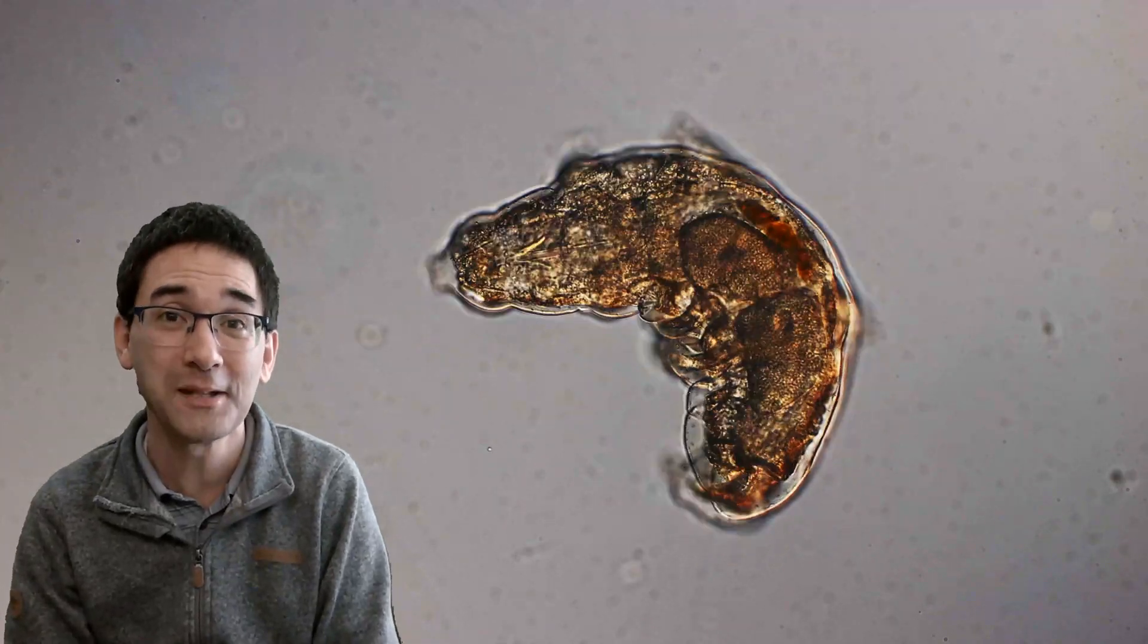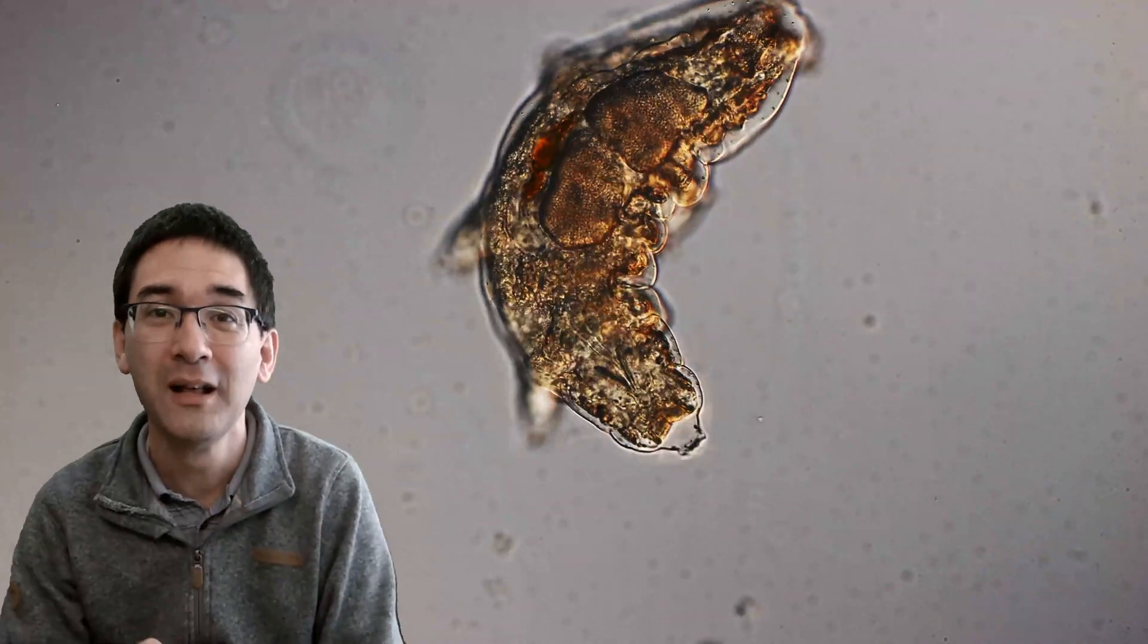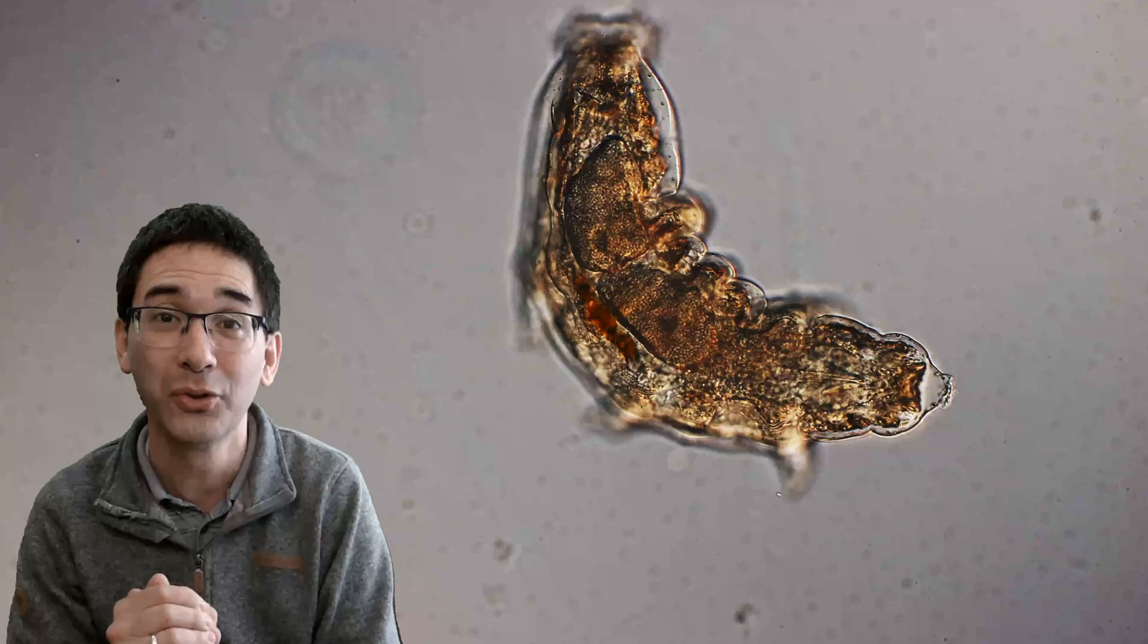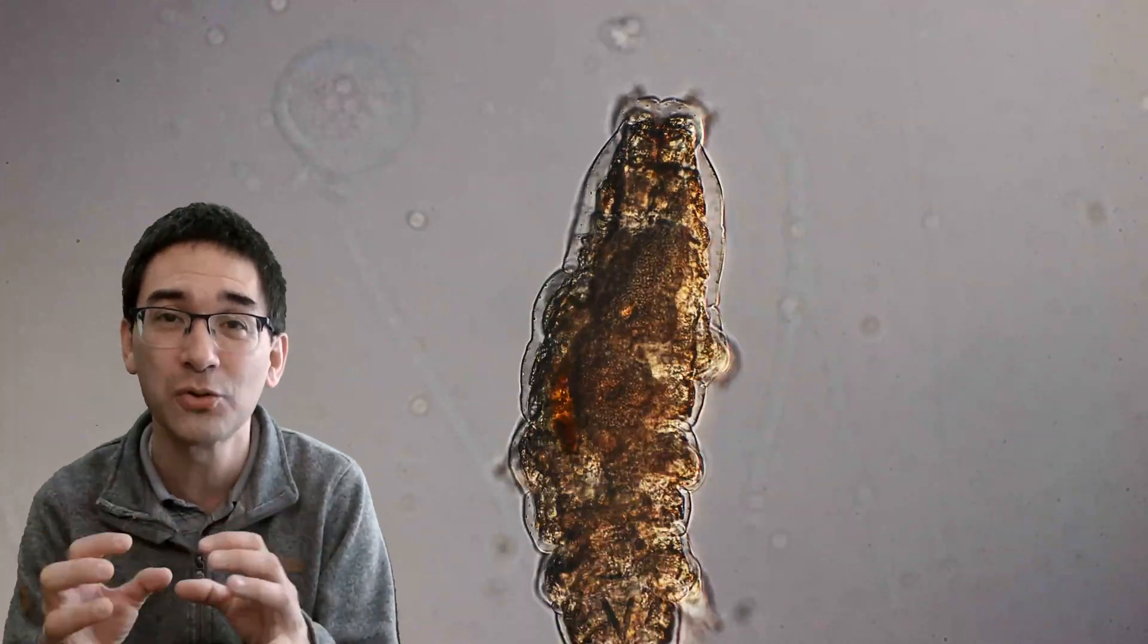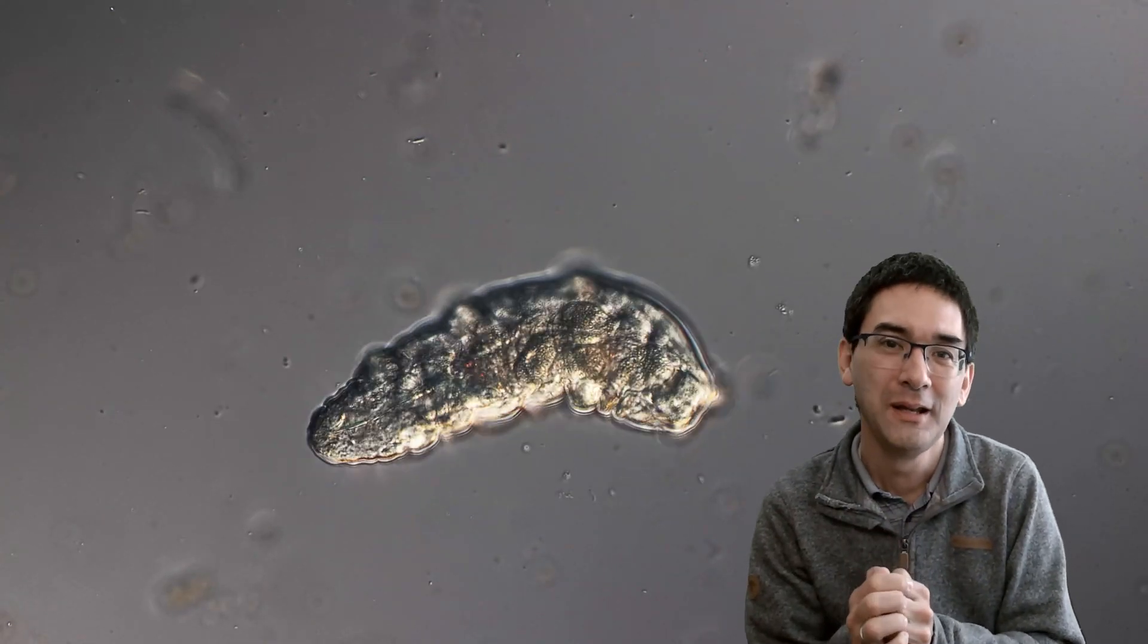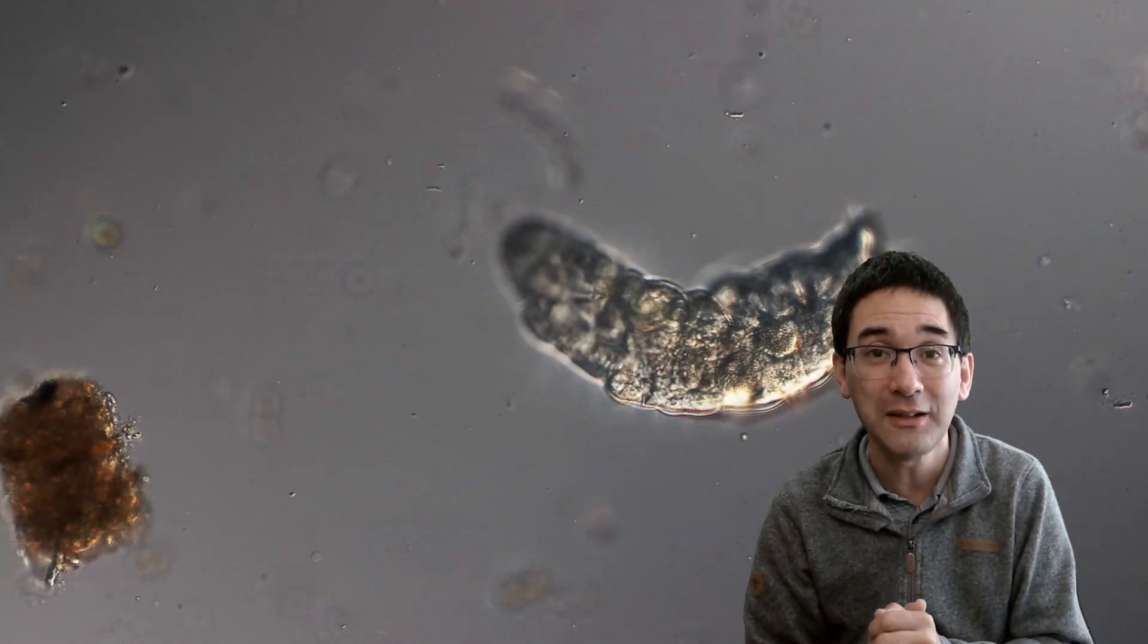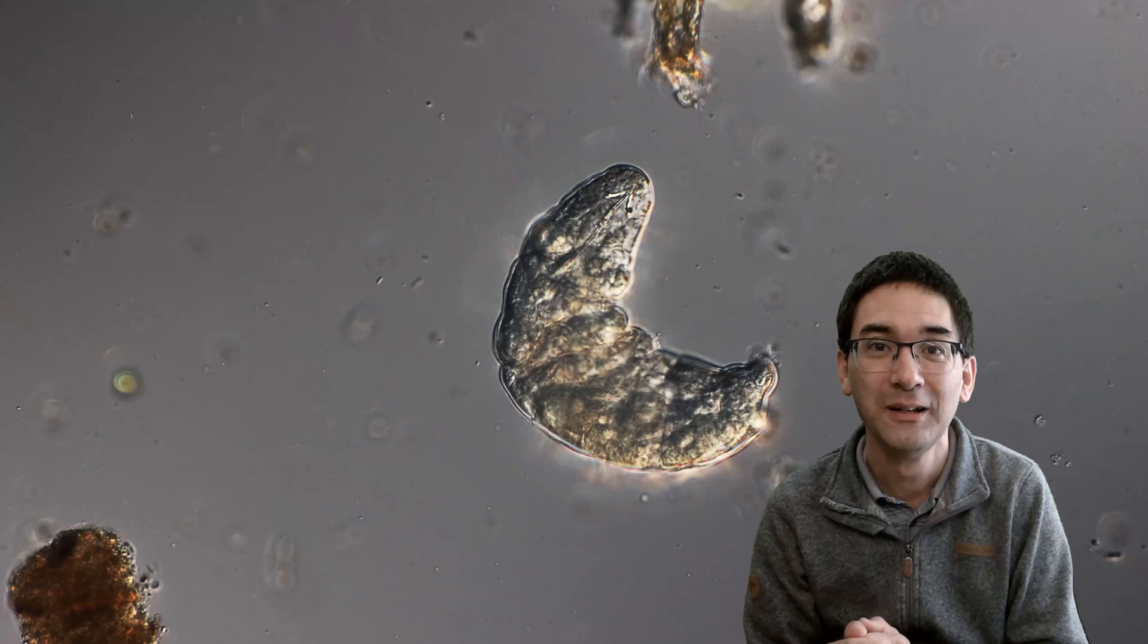Those tardigrades do look a little bit clumsy. Sometimes they fall over a little bit and they have a problem really crawling forward. And that's because the microscope slide is so extremely flat and smooth. But as soon as there are some other particles in there, some leaves and so on, they really like to cling to those and they don't like to let go. Yeah, I think what I'm going to do for today is I'm just going to leave it at that. I hope that I also motivated you to hunt for those little creatures.